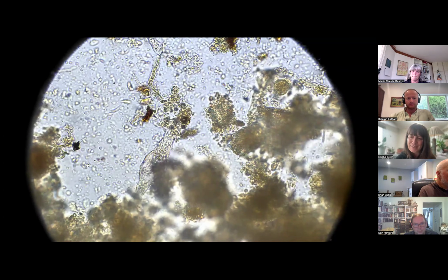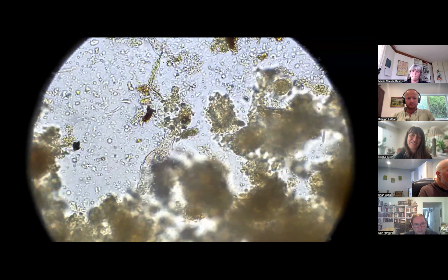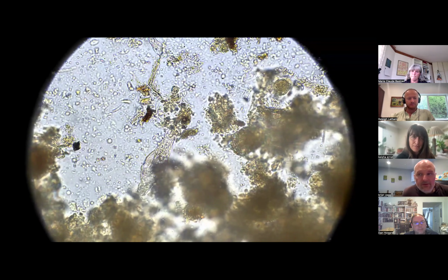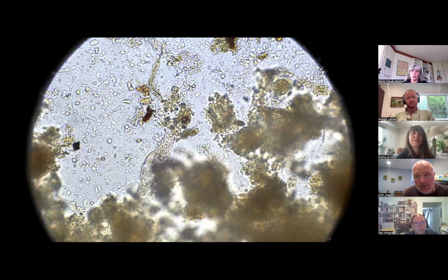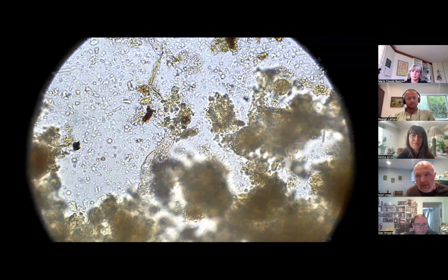But yeah, it's not necessarily that it's going to stink and there will be rotifers present. I've seen rotifers in very healthy aerobic soils as well, usually not in the quantity. Here, we just saw an active rotifer, and this is a dormant one. Right here, not dormant, but resting. It's not feeding at the moment. And I saw another one.